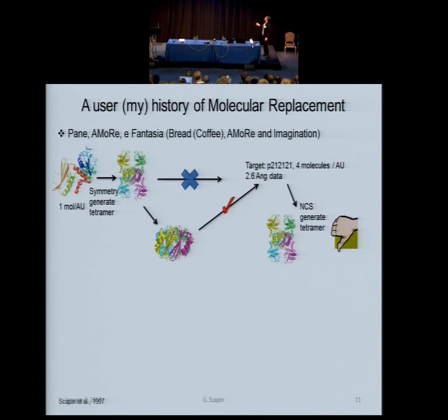It probably had something to do with the fact that these 4 domains are just linked by one linker, and there's probably some motion that I wasn't taking into consideration. So I tried to use the individual domains as a search model, but that didn't work. They weren't big enough back then to generate enough signal. I tried to refine this portion and use the FO minus FC map to manually build in the rest. That didn't work either. They weren't clear enough.